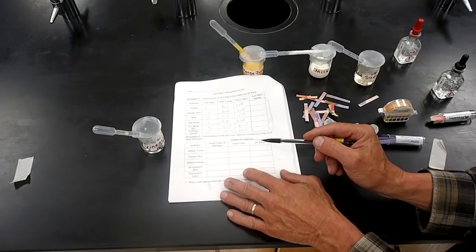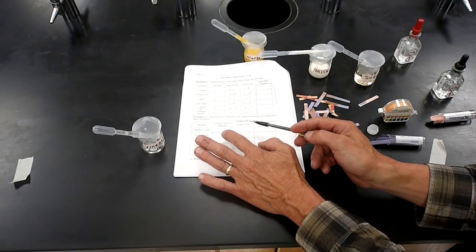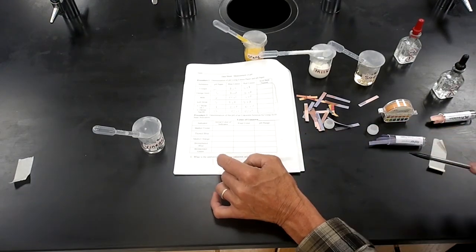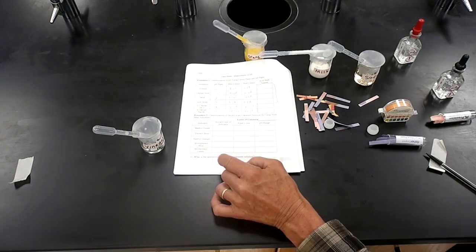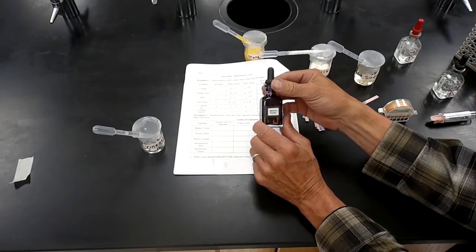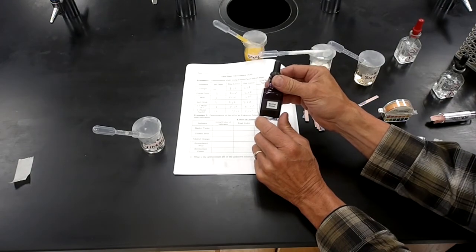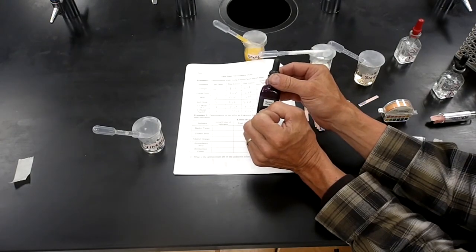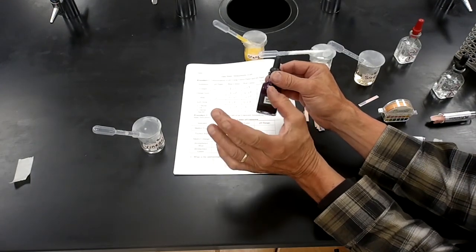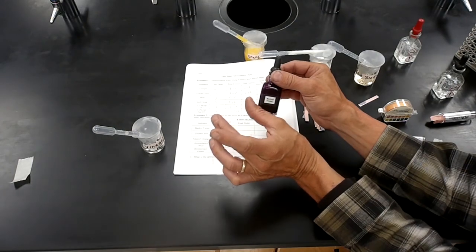That's it. Now, for the next one, I'll add another video of procedure 2. Procedure 2 is kind of cool. What we're going to do is use various pH indicators. You probably use this if you had an aquarium. You take a sample of water, just like we did for the freshwater ecology lab, and you put an indicator in it. Most of these indicator dyes have a range of pHs where they will change color.